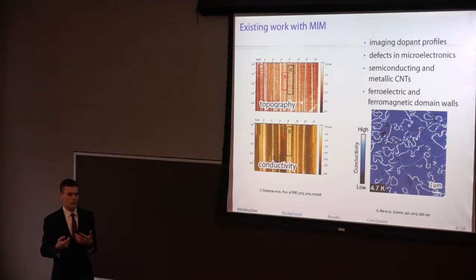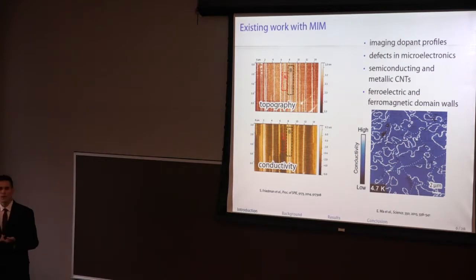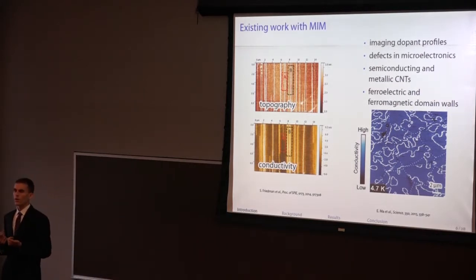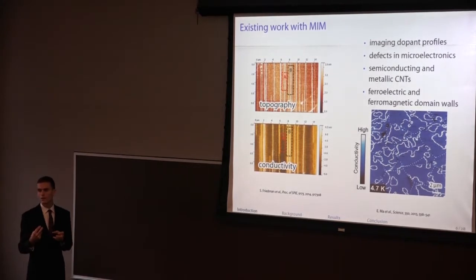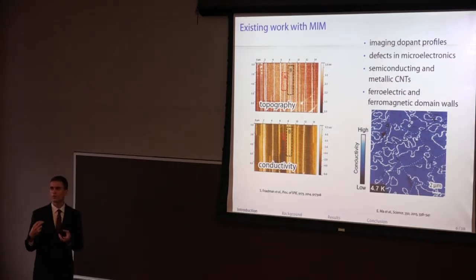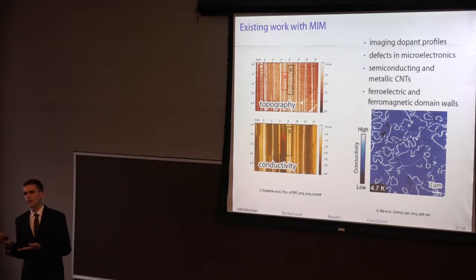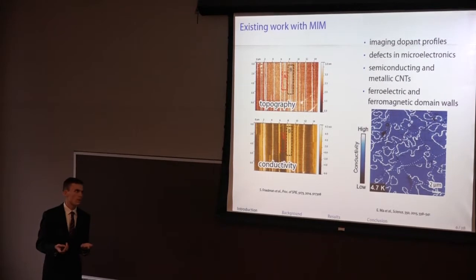For instance, it's been used, I mean, there are already several publications out there. It's only been around for a few years, but just a simple example that's particularly well-suited is the measurement of carbon nanotubes according to their electrical properties. So carbon nanotubes have somewhat different structures. They have differing chiralities, which just refers to the orientation of atoms within the tube. That different structure can actually change the electrical properties drastically. So depending on chirality, you can see either semiconducting or totally metallic nanotubes.